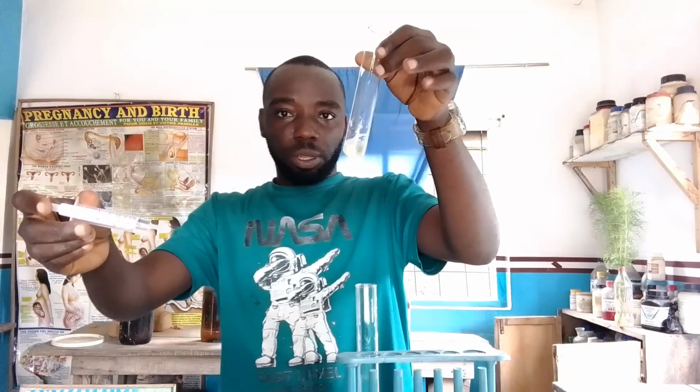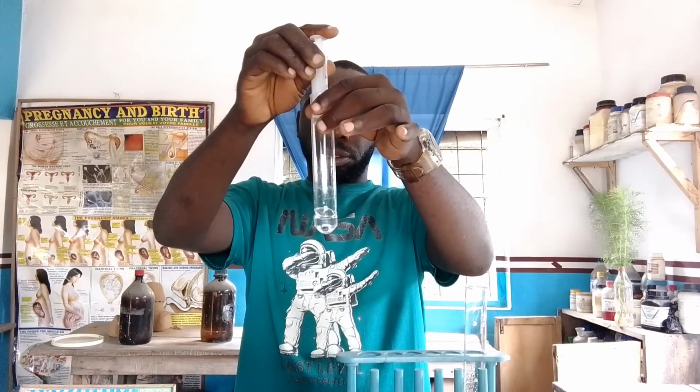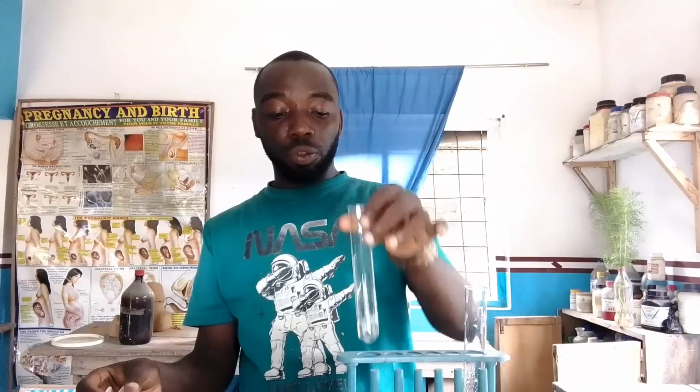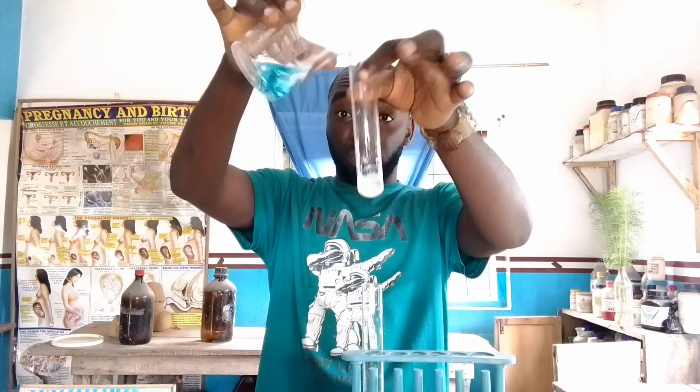Okay, so you can see now I'll still be doing the same thing in that of our H, and also I will shake it. So now the next thing there is to put drops of this copper solution, just 1% copper solution, and we are going to be checking the reaction. Now look at this, just be observant.